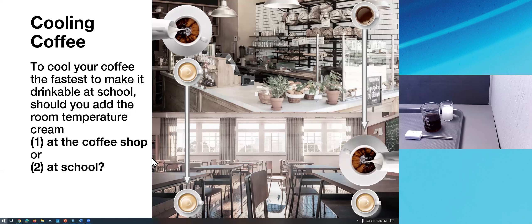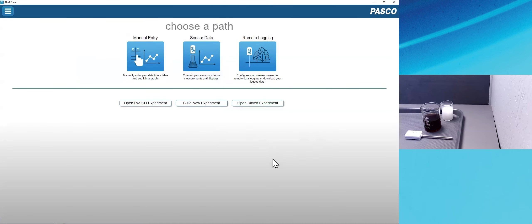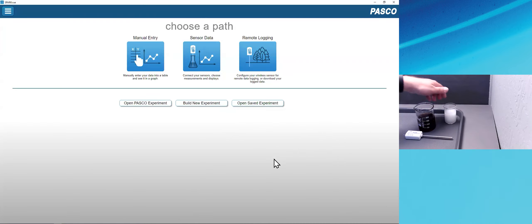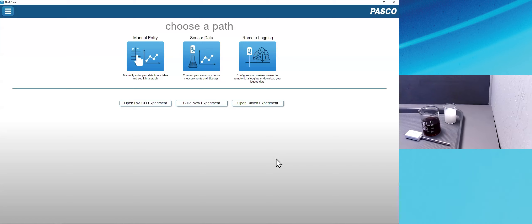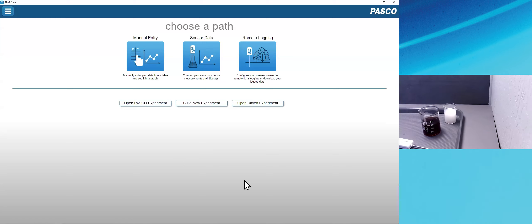Let's jump over to SparkView. I'm going to launch SparkView — I happen to be on a Windows computer, but everything I'm going to do here applies across platforms. When we launch SparkView, we get to what's called the welcome screen, which asks us to choose among six different commonly used paths. We're going to choose the sensor data path, which allows you to connect your sensors, choose measurements and displays — and that's often applicable across activities.